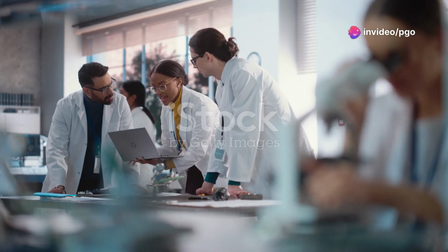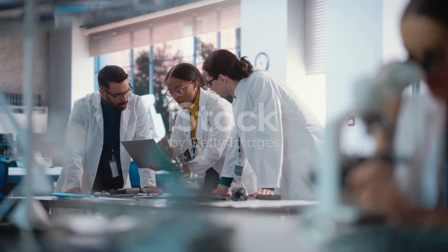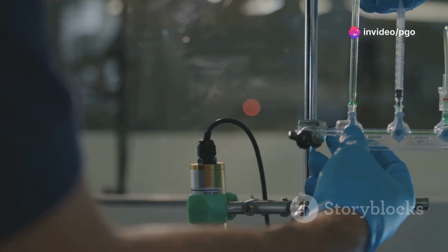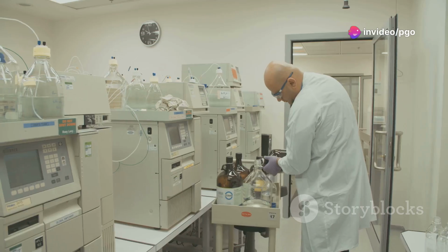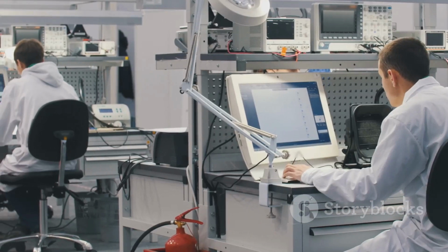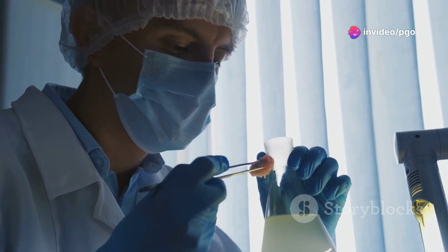Section 4. When traceability gets tricky, finding other ways to ensure accuracy. Sometimes metrological traceability isn't possible for certain methods. It's like trying to fit a square peg in a round hole. But don't worry, we have other ways to ensure accuracy. We can use things like control samples, replicate measurements, and statistical analysis. These methods help us detect errors, assess variability, and ensure our results are reliable.